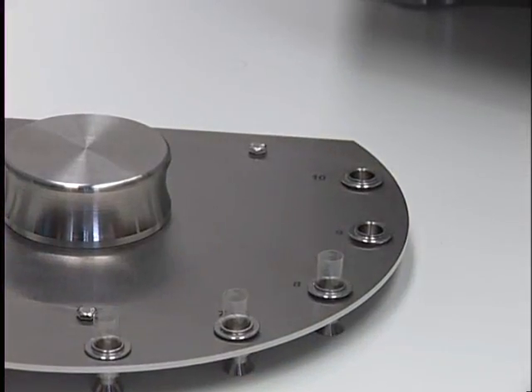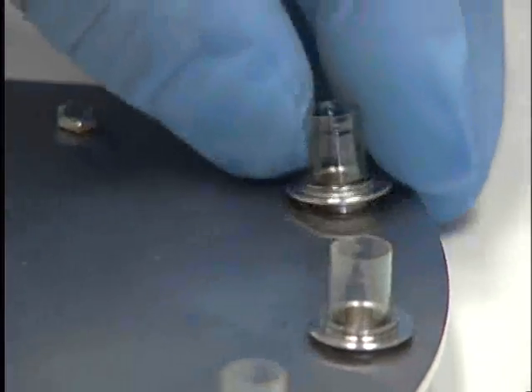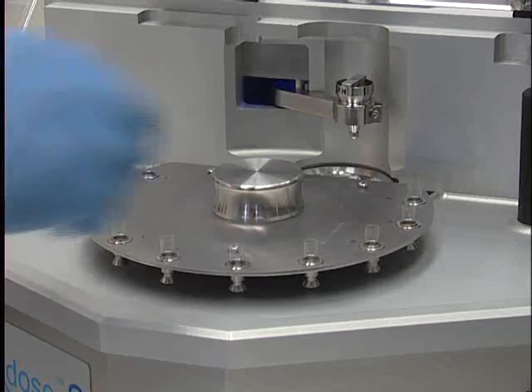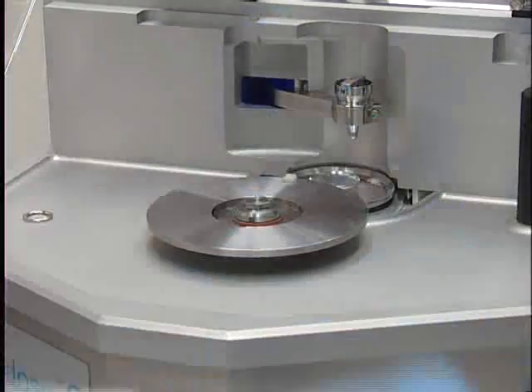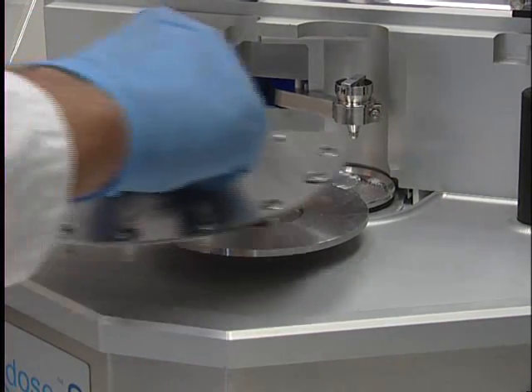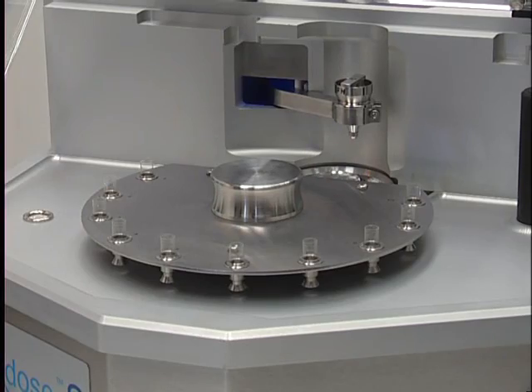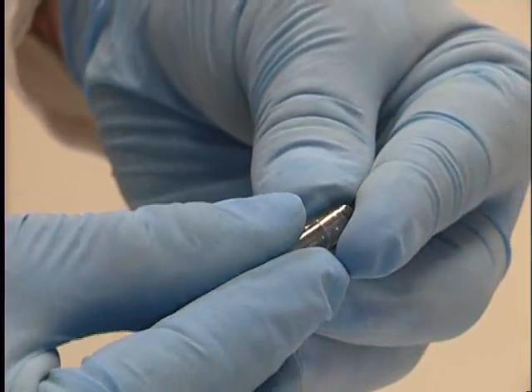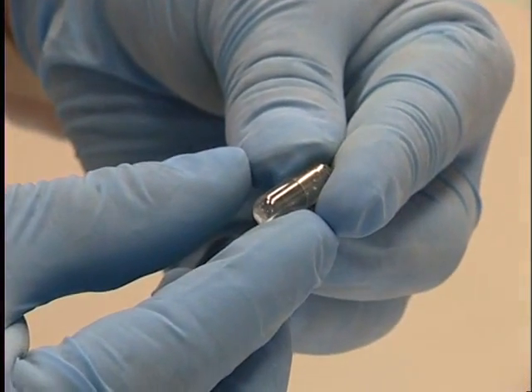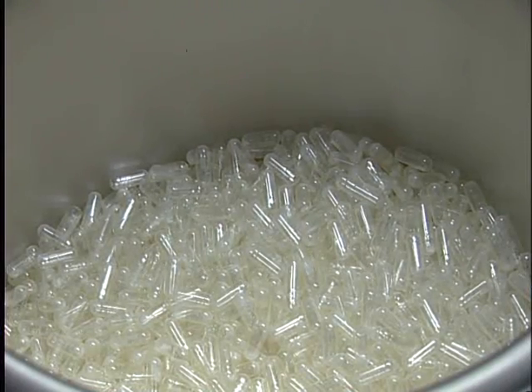Size zero capsules are being prepared in order to demonstrate the ease of change between different capsule sizes. The dial plate is homed prior to removal. The filled capsules can be replaced with the empty capsules and the sequence continues. The operator puts caps on the filled body and the sequence is complete.